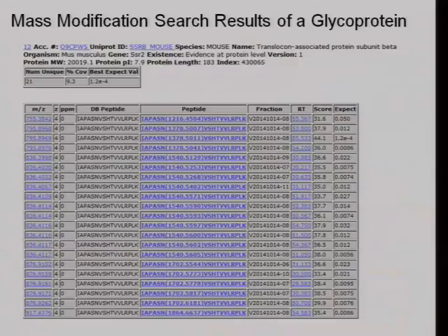If you're doing MALDI, your sample is a solid, and so what you'd have to do is fractionate your sample, collect the fractions, and then spot each fraction onto a plate. Most people are not patient enough to do that, or you can get robots to do that, but it's much slower throughput.